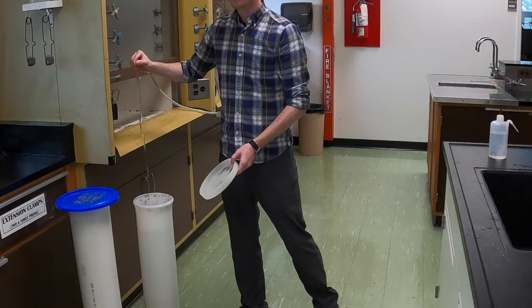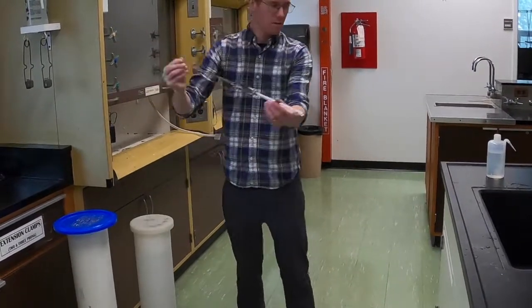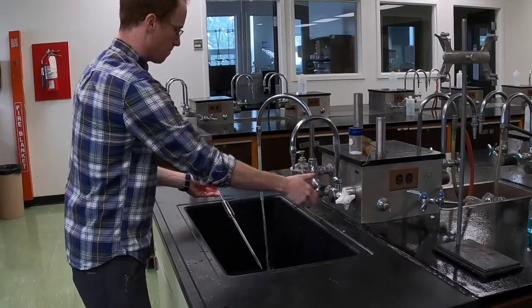You need to clean this type of volumetric glassware before you use it. And the cleaning steps for pipettes and burettes are almost identical. In this video, we'll be showing you the cleaning steps for a pipette, but you should know that these cleaning steps are effectively the same when you're using a burette as well.